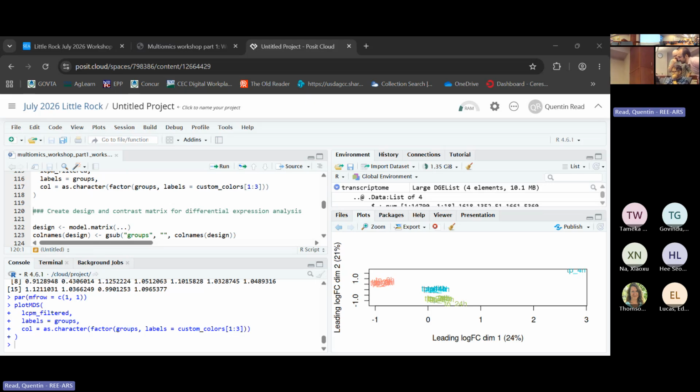What is the dim of the filter again? Let's look at that. Mine looks fine. Here we go. Yeah, yours is smaller, so somehow you're using different data than me. If you missed a line, it could look different. But yeah, yours is different.